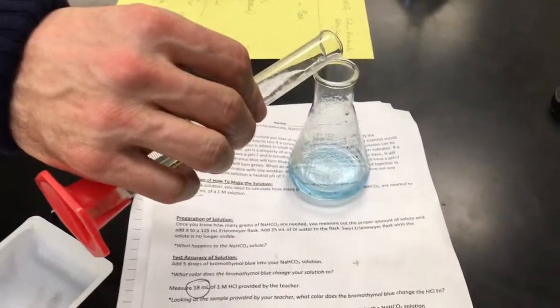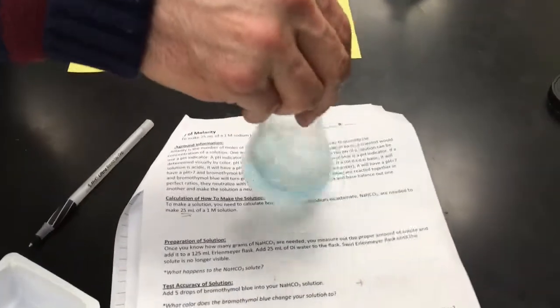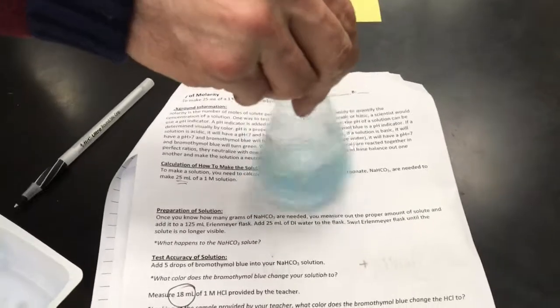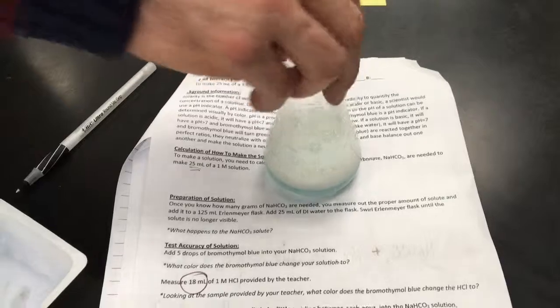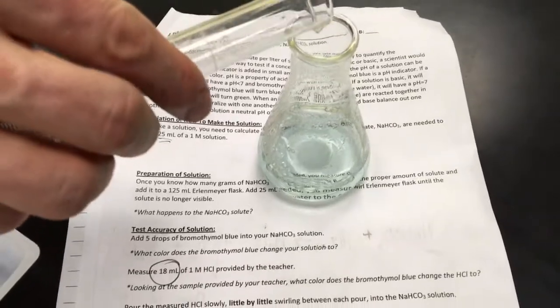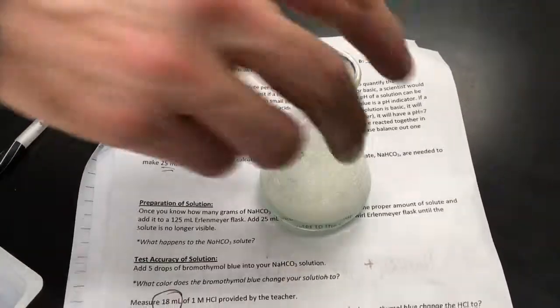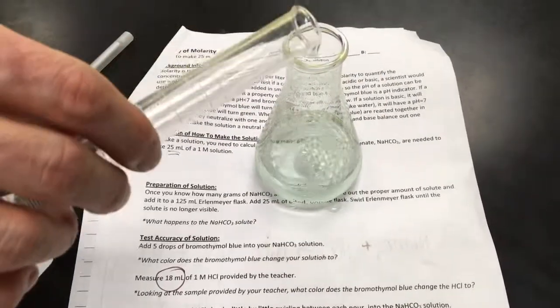Okay, now we're going to take our acid. This is 1 molar. We're going to add it in just a little at a time. Whoa, look at those fancy bubbles. We got bubbles. Okay, all right, and then just a little at a time. So those bubbles, yeah, I'm noticing the color. I think that's a little CO2 happening. Oh, carbon dioxide. Whoa, so look out. This is why you really got to do it slowly. And you can see colors changing. Yeah, it's definitely going to a light green now.